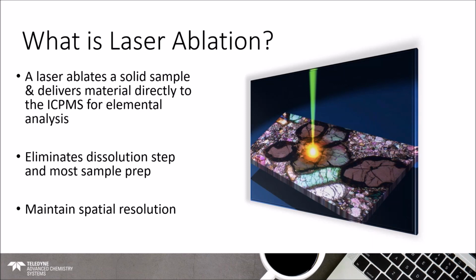We're able to avoid the requirement for a microwave or a hot block in order to help that digestion process, and it saves a lot of time because of it. We also then are able to realize the second major benefit after avoiding the dissolution step, which is the maintaining of the spatial resolution for the sample.